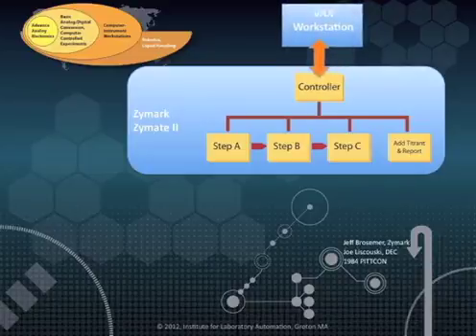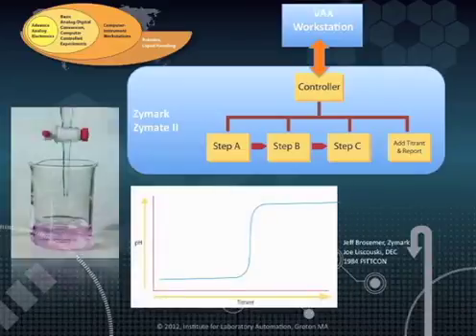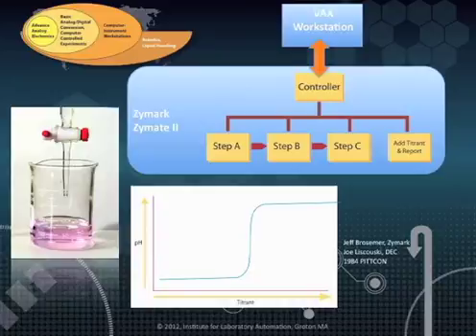One common experiment that's been done in laboratories is titrations. You may have done one in high school chemistry, where you added a liquid, a drop at a time, to a second liquid in a flask or beaker until a color change occurred that showed when the titration was completed. When this process is carried out with robotic systems, the robot does everything and returns a single value for the results of the analysis. In this experimental version, the robot would carry out sample preparation steps and add titrant under the command of the host computer system.